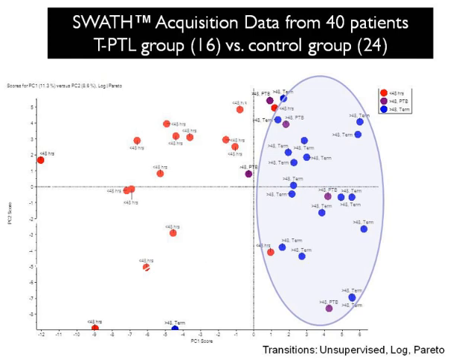We took white blood cells, we put them through mass spectrometry, through SWATH, did the data reduction, and we had a million data points. The idea was to try and find signals that differentiate between women who are going to give birth and women who don't. So this is a very small clinical trial, very small. And I do not mean we have found biomarkers for threatened preterm labor here.